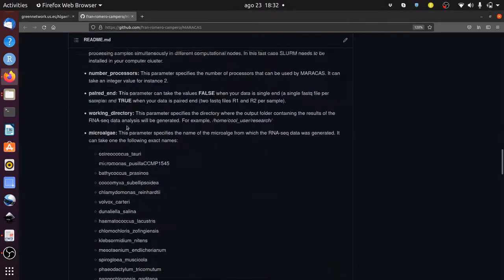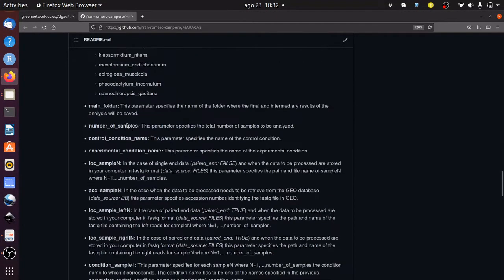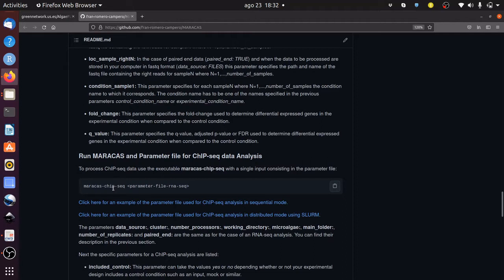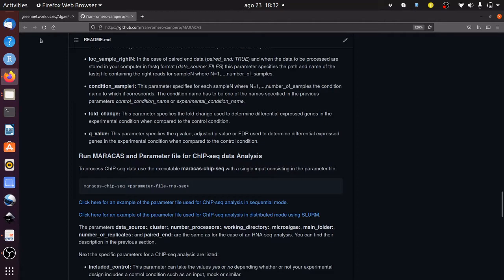On the other hand, we have Maracas ChIP-seq that receives as input cistromic ChIP-seq data for transcription factors or histone modifications and returns a list of genomic positions or loci occupied by the corresponding transcription factor or histone modification in BED format and the genome-wide mapping signal in BigWig format.